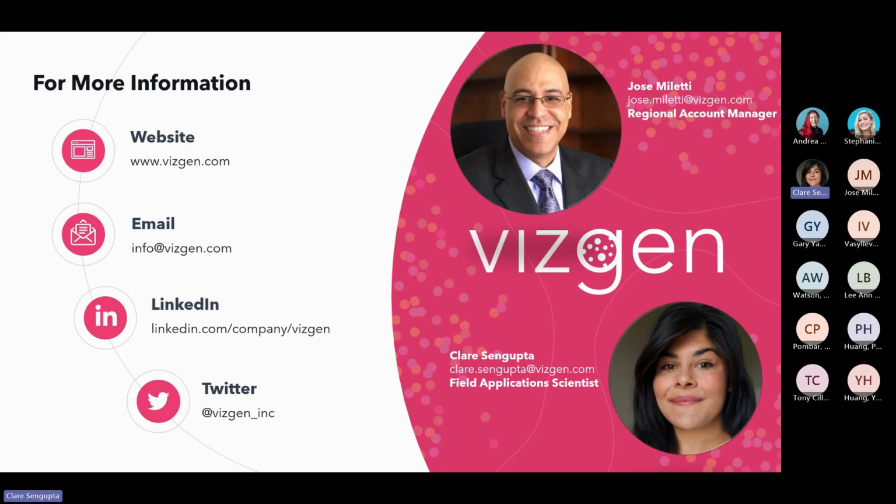And the second is a Cellpose driven algorithm. So this is an AI-based algorithm, which again, like your question asked, is based on membrane stain. So we support cell membrane stain. We have a kit for it that we can provide users to do this kind of segmentation. This segmentation is done in line with the processing of the images at the end of your run, and you as the user have the control over which algorithm is selected for your data.